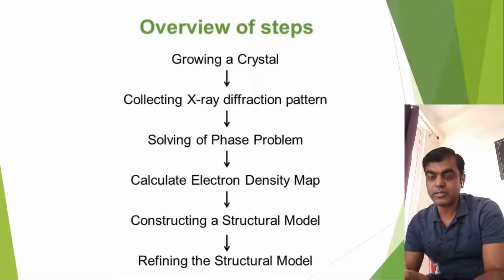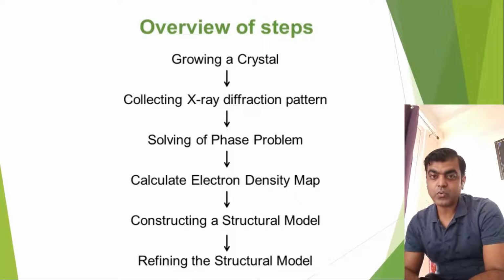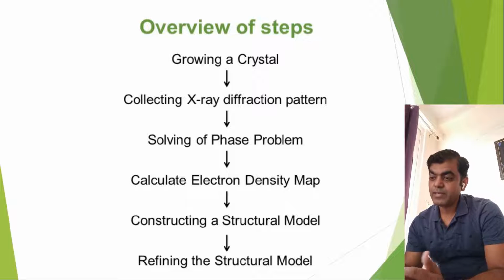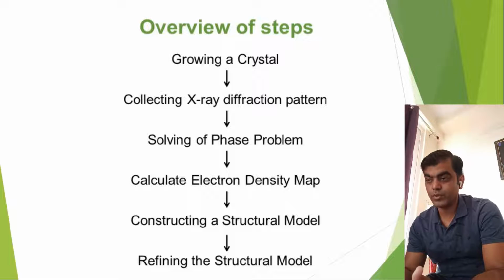And once we have constructed a rough model of the structure you have identified, then comes the refining of the structure, so that it is as similar, or very close, to the actual structure which you are studying. And how you are going to do it, that we are going to show today.